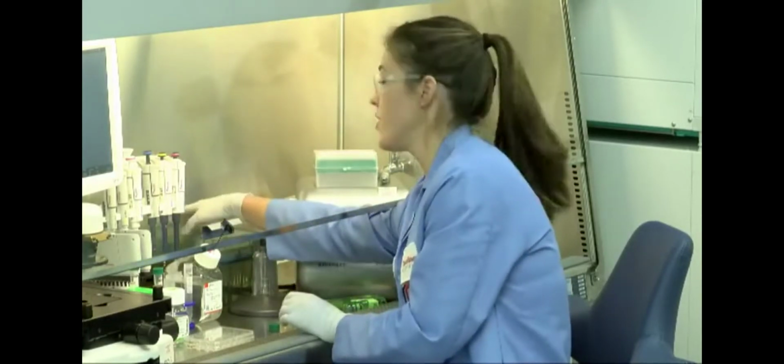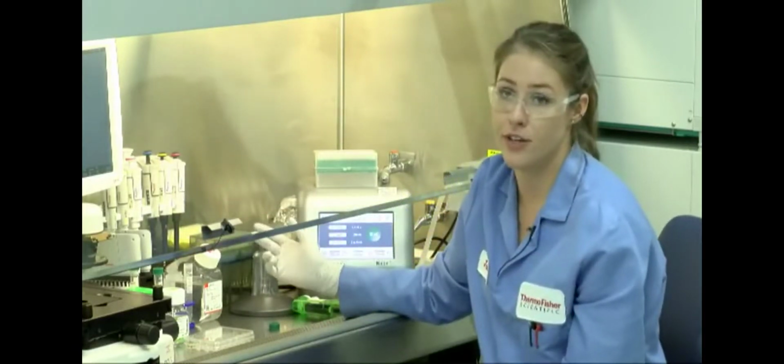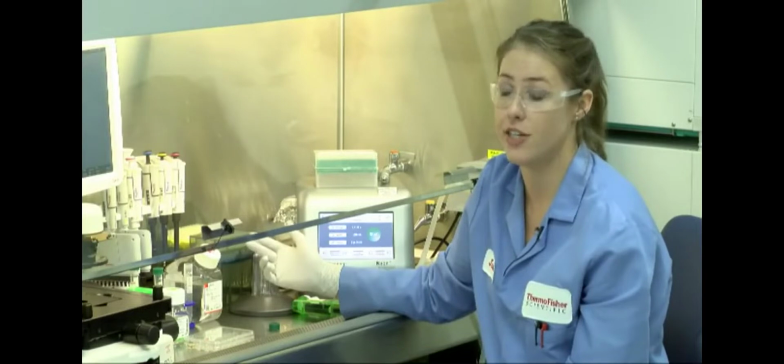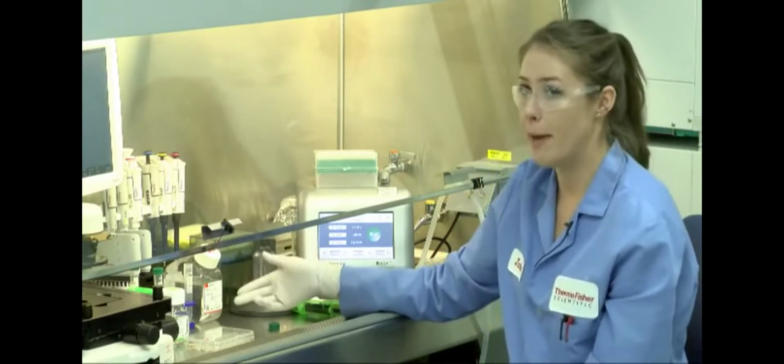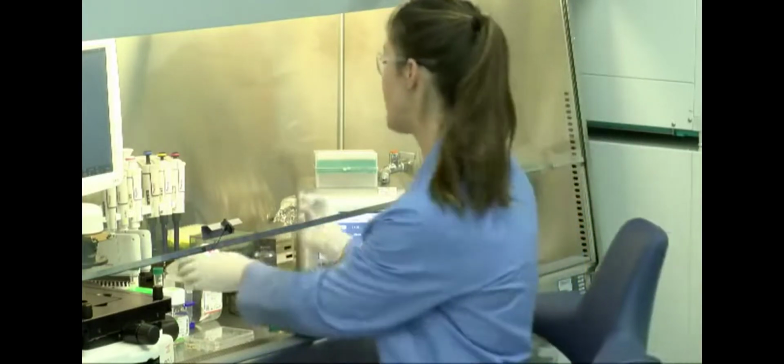You want to make sure that your cells are singularized, because this will be the best for transfection and give you the best transfection efficiency, so I'm going to just pipette my cell suspension a few times to make sure they're still singularized.